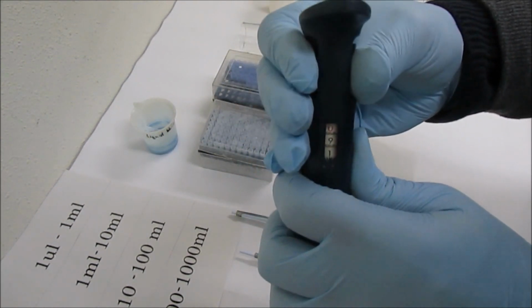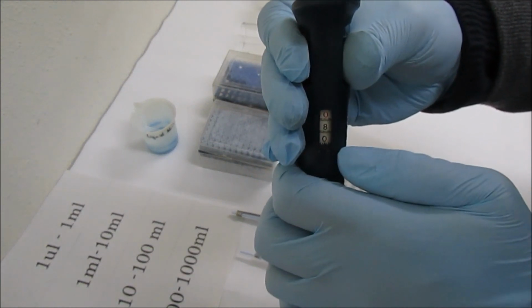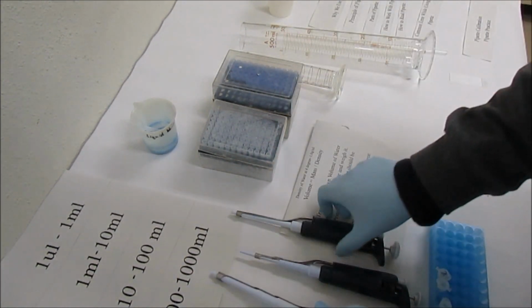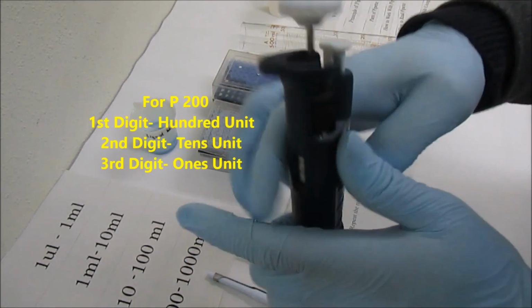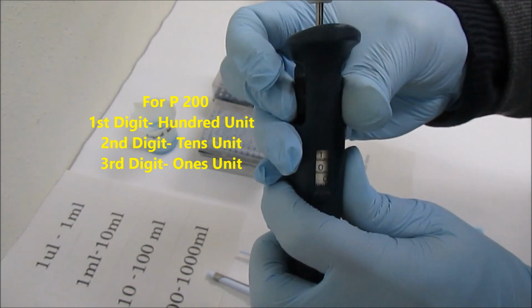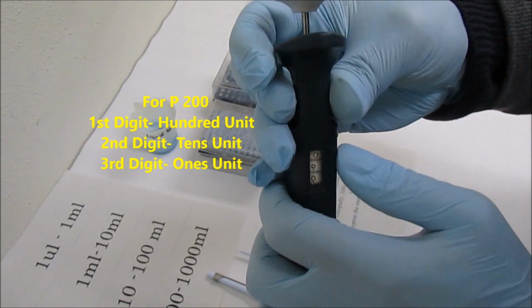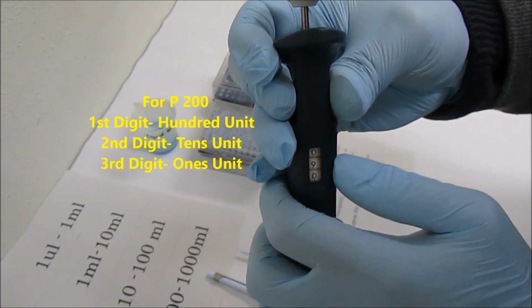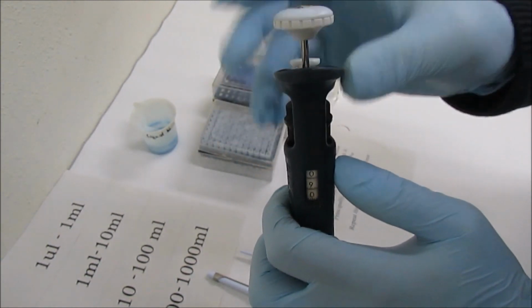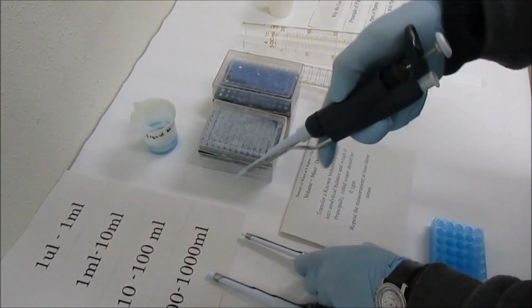Now this is 900. Now this is 800. So the first digit refers to the 1000s. And if it is 200, the first digit refers to the 100s. So now this is 100, right? And the second digit refers to the tens, so this is 90, right? Whatever the maximum limit, the first digit refers to that.